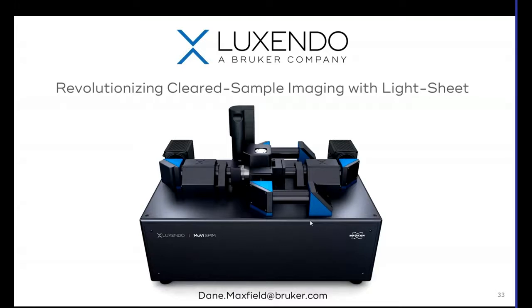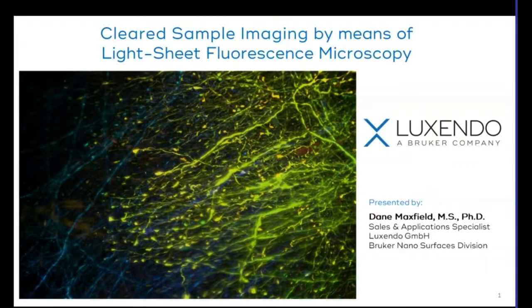How can we do live imaging if we have to fix tissues? That's the conundrum here. So the idea behind this light sheet is that it will switch between live cell imaging and cleared tissue imaging, but those are typically mutually exclusive applications. Biggest sample we can put in the chamber, that is 12 millimeters wide and 16 millimeters long and 19 millimeters deep. And that is the single-sided imaging chamber.